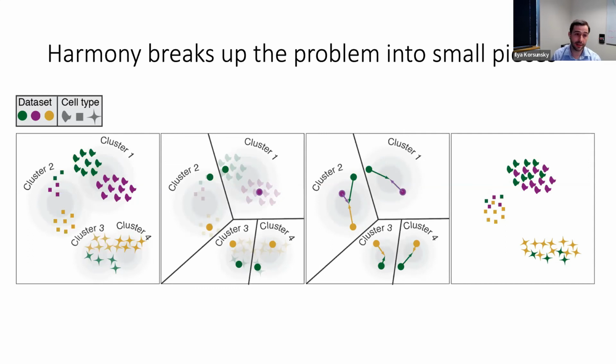Sure. So I'll say that one thing that's very different from a lot of the other, especially early batch correction algorithms, is that we don't use KNN graphs at all, right? Seurat CCA, MNN correct, Scanorama, BBKNN, they're all kind of in their own family of batch correction and integration algorithms, because they do basically what you're saying, Nikolai, which is they find these nearest neighbors, right? And in fact, a lot of them have kind of converged to the same algorithm in a sense, because they all use mutual nearest neighbors, they all use the same heuristics for dataset ordering and everything.